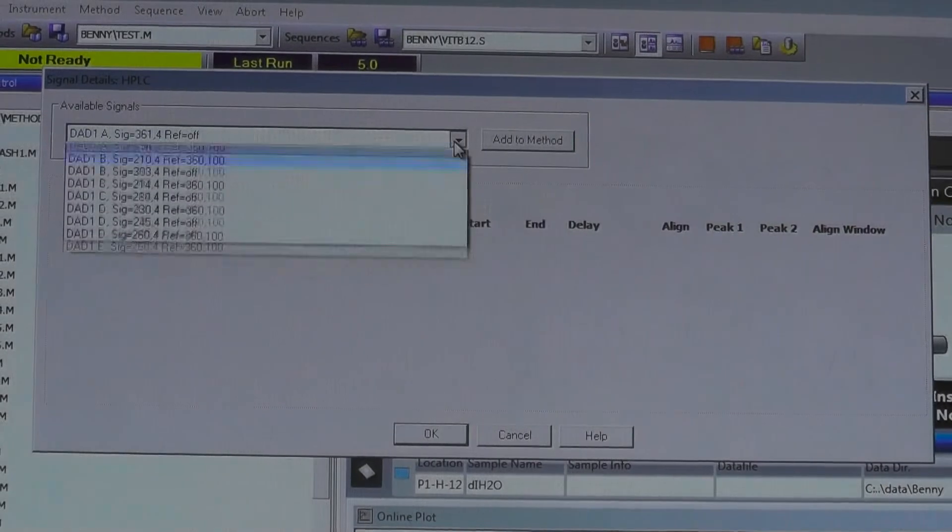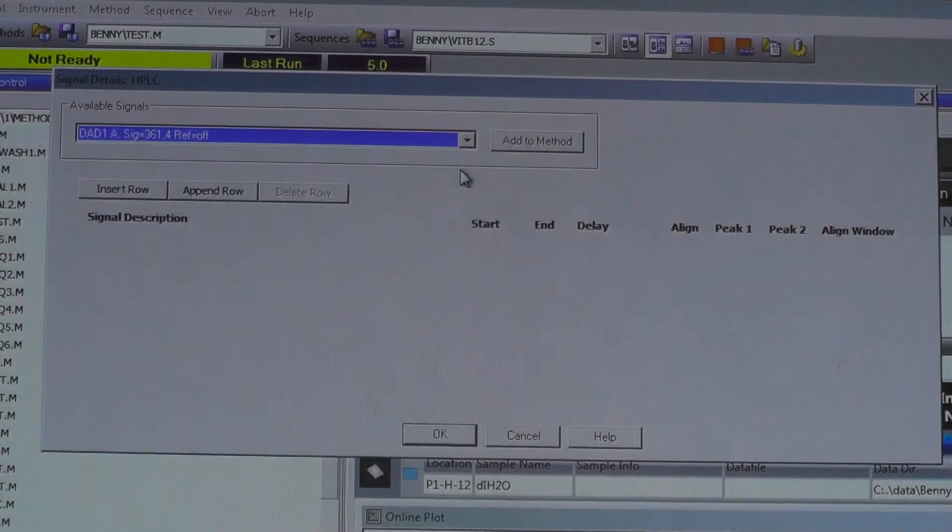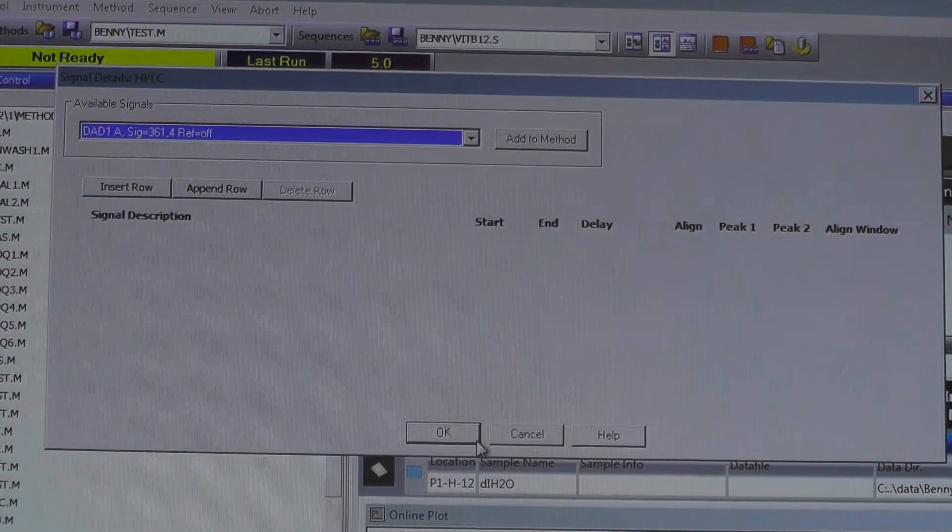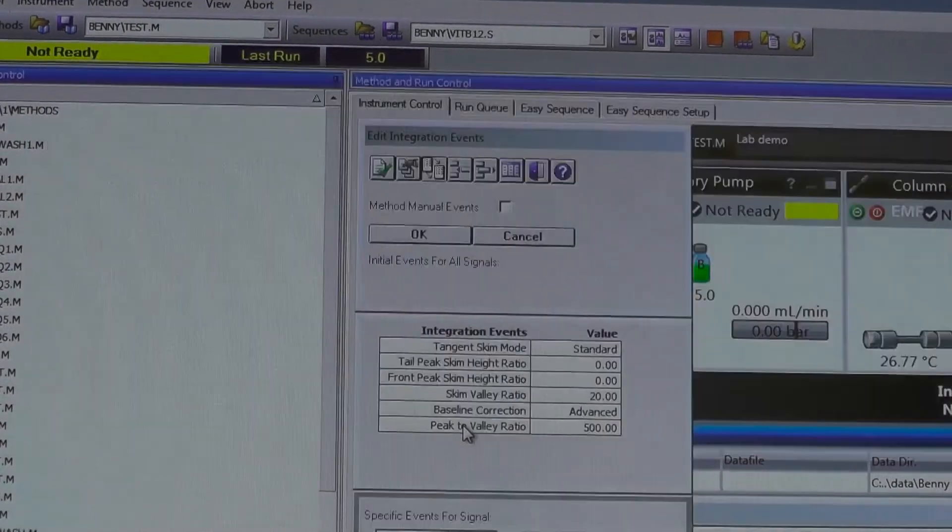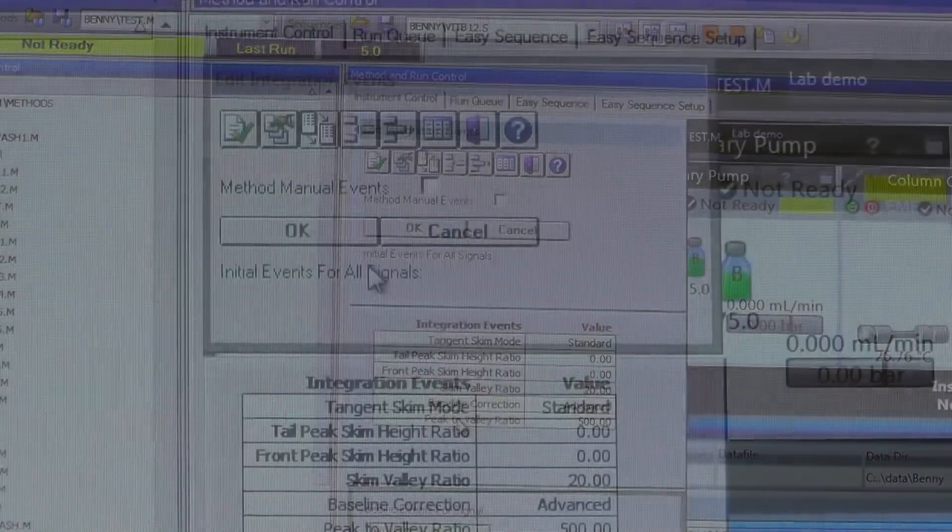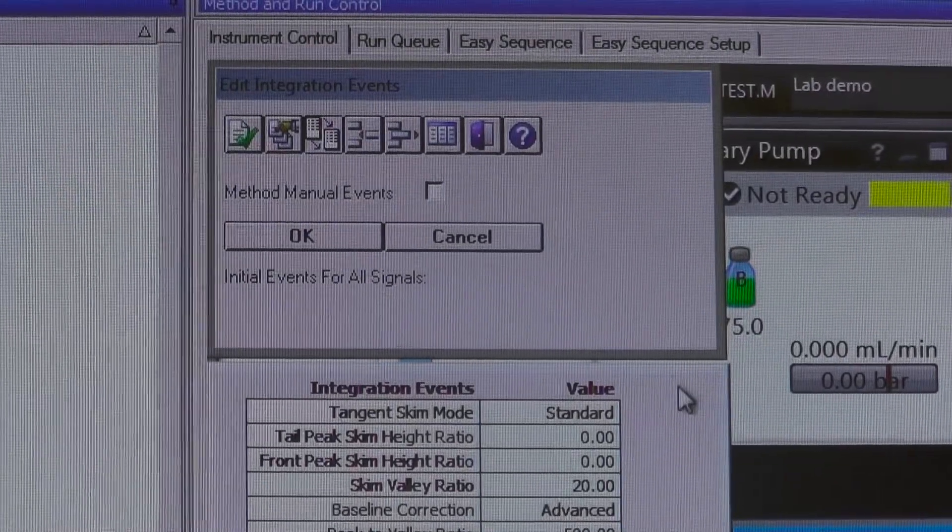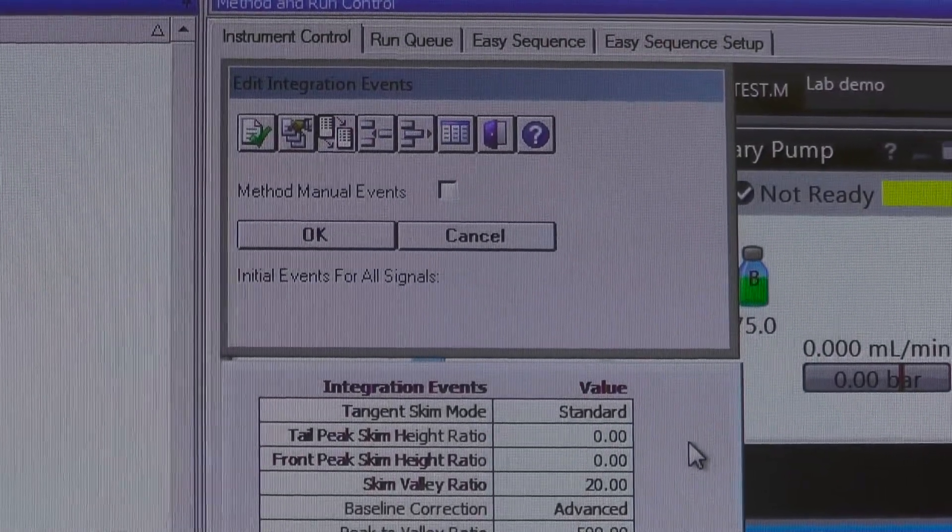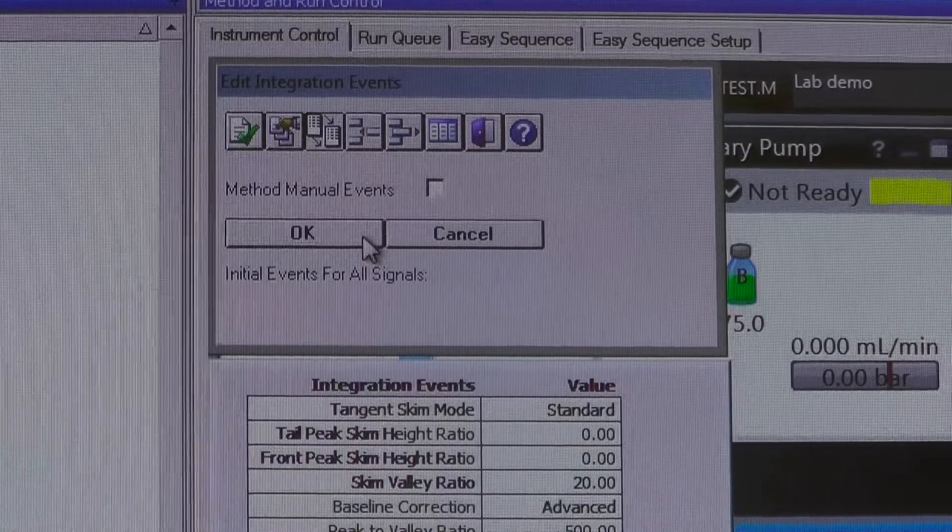Next, a Signal Details window will pop up. You can change the signal settings according to your needs. Click OK to continue. Then, an Edit Integration Event window will appear. Do not change these settings. Click OK.